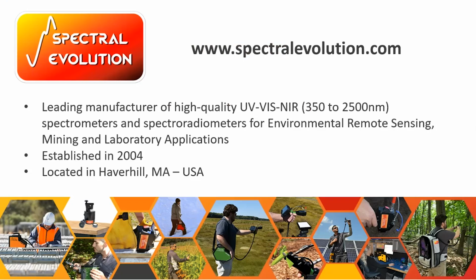So to start off, I'll be introducing Spectral Evolution. Spectral Evolution has been around for 21 years now. It's the leading manufacturer of UV-Vis NIR spectrometers and spectroradiometers. And we're located in Haverhill, Massachusetts, so the Boston area in Massachusetts.